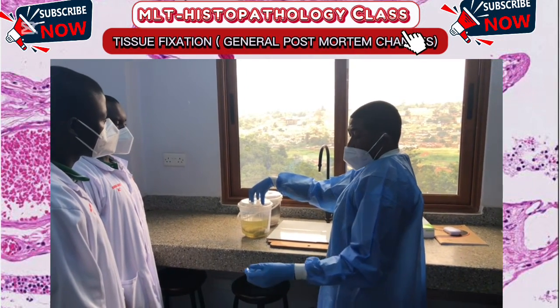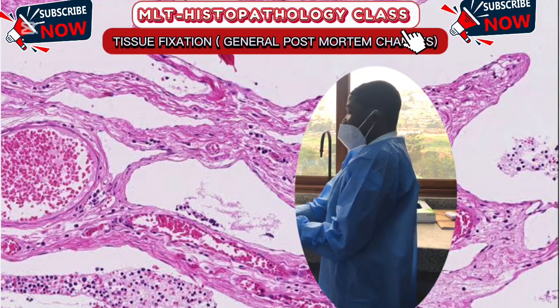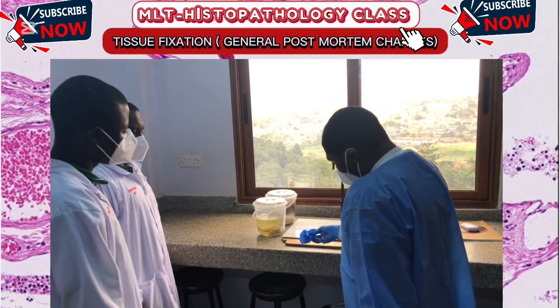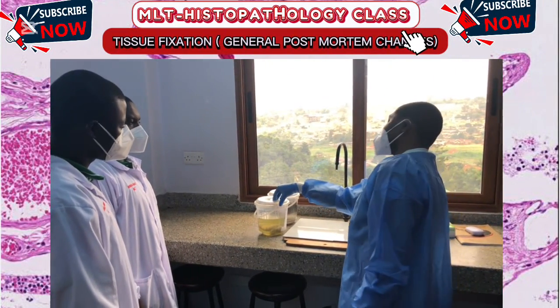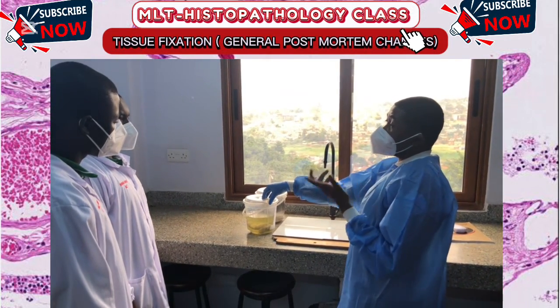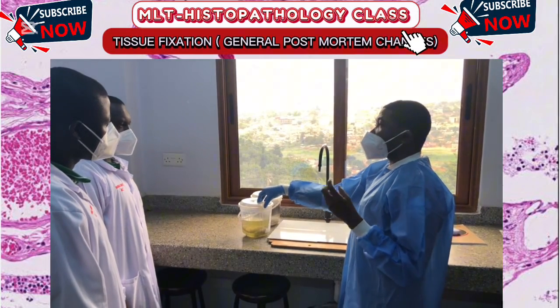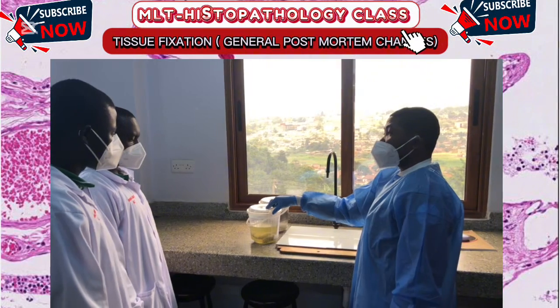Okay? And the major purpose why we are fixing this tissue is to stop what we call autolysis and putrefaction. So autolysis is enzyme digestion, whereas putrefaction is bacterial action on tissues.